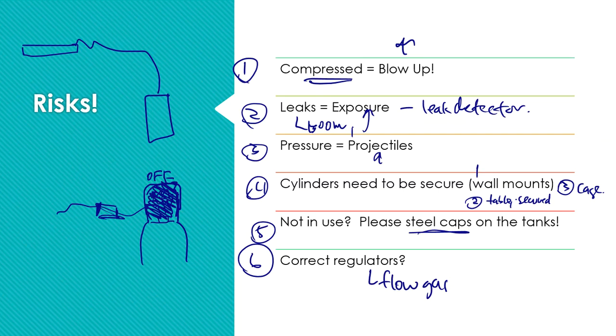So what's happening here is that there is an attachment most of the time to the valve piece. And I've just drawn it out here to the left just to separate it so that way you can see it a little bit better. And very often there's two different types of dials on this regulator piece. One of the dials will have a meter and it will be up at a certain level.